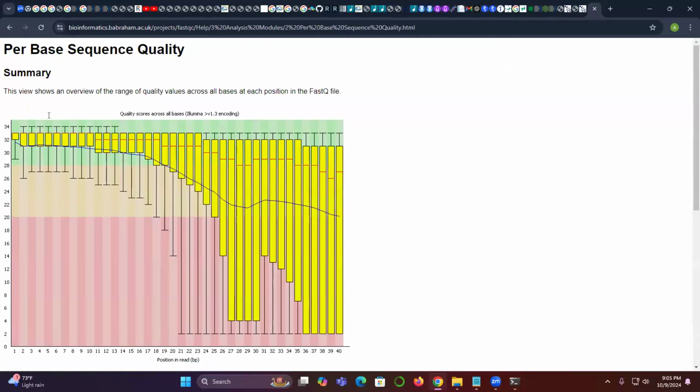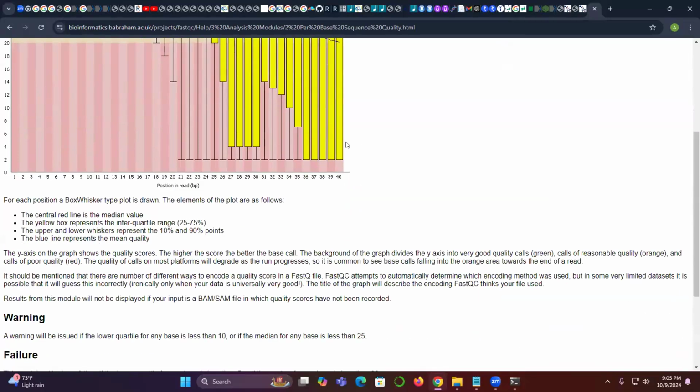Open this. Now every information they are mentioning, just go down. So at home, if you want to read more about this QC, you just open this analysis module, you will get the information for each section. Clear, guys? Yes. Okay.